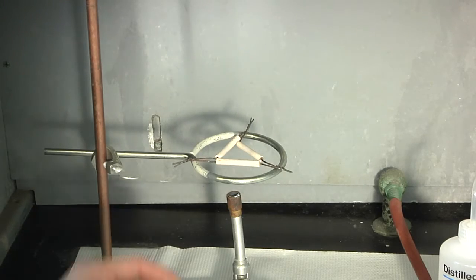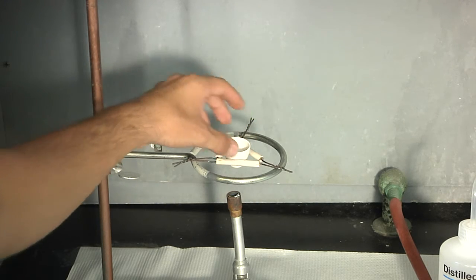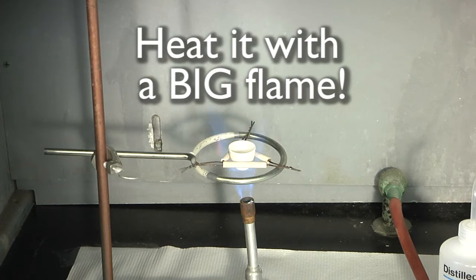Place the crucible on the triangle on the ring stand. If it doesn't fit, you can always adjust the size of the triangle manually. Dry it, then heat it intensely for five minutes.